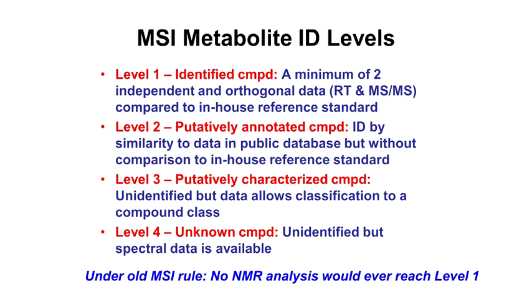And then there's the unknowns. These are peaks that are real peaks. Everyone knows they're peaks. They're reproducible, but we don't know what they are. And as I say, there's thousands of those now, and they're simply identified as unknowns. So in many publications now, people ask for you to formally declare which level you've achieved with the metabolites, with the tables that you publish, or the data that you submit.